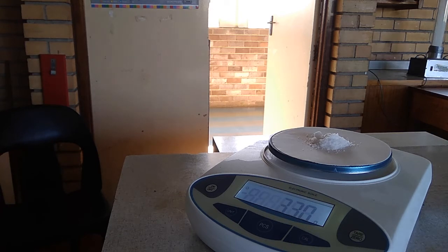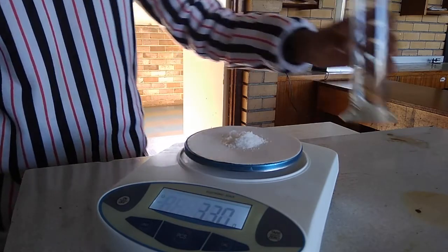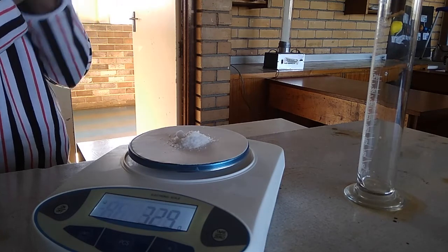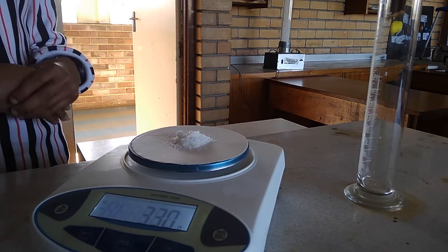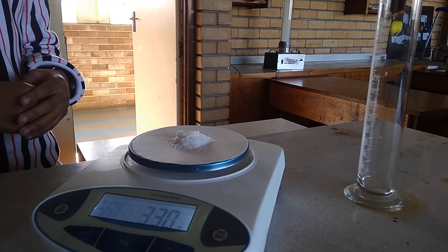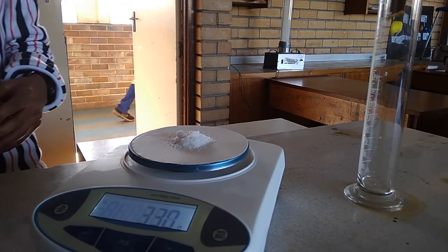Okay, Jared, won't you grab, what is this thing called? This thing here that I'm pointing at. Okay, grab that beaker, which is otherwise known as a measuring cylinder. Won't you put it there in the shot? You can just put it anywhere where you can see it. Okay, that's great. Now, this is what you've got to do. You've got to pick that piece of paper up carefully, fold it into a kind of a curve, maybe squash the one end, and then you've got to pour every last grain into there, otherwise you've got to start again.